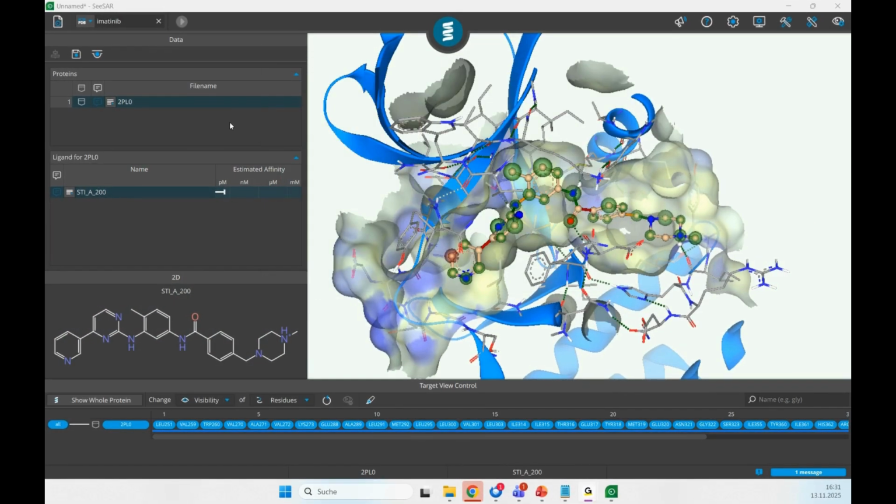So this is where we interact with the protein structure, can load the structure, can align binding sites, look into them, analyze them a little bit more conveniently. You can also use it to look up or explore your binding sites. So let's assume I would like to know where my leucines are, or I'm looking for maybe a cysteine. Is there a cysteine present? Is there maybe a lysine? Yeah, there is one lysine present. And if I use this one to look for the 3-letter code of the amino acids, it's possible.